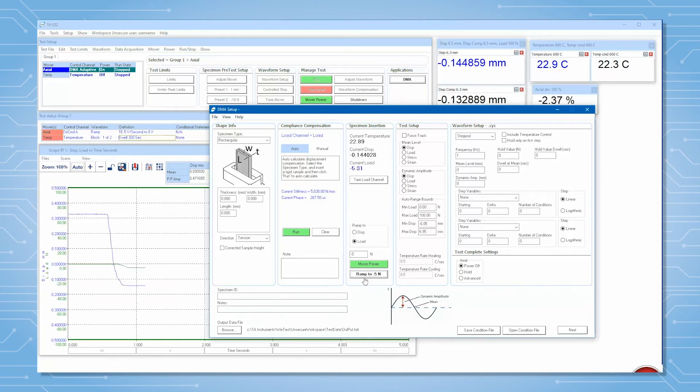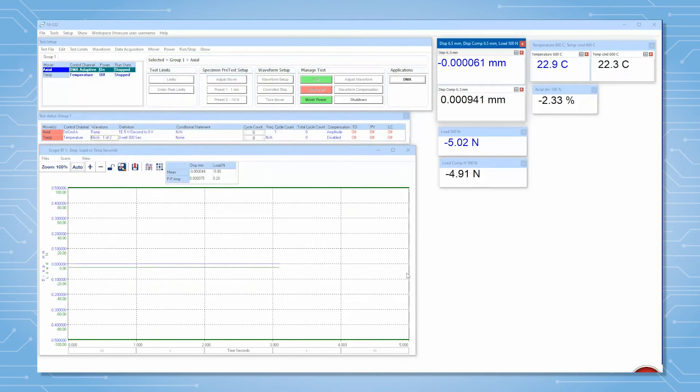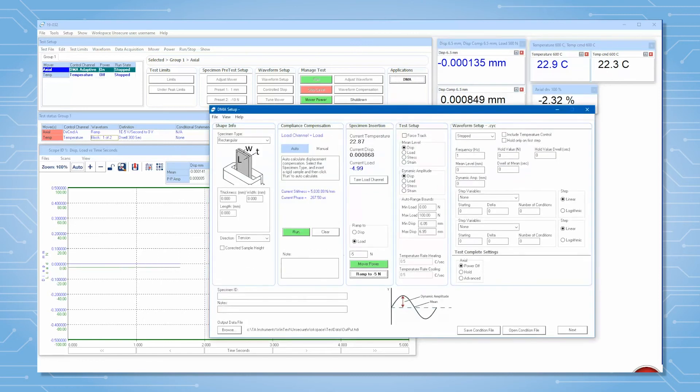Right click on the displacement meter in WinTest. Click on Properties and press Auto to set a new tare for your displacement. Your displacement meter shows zero millimeters now.